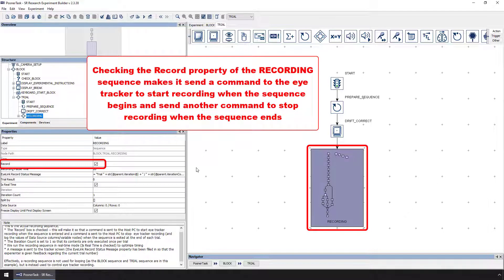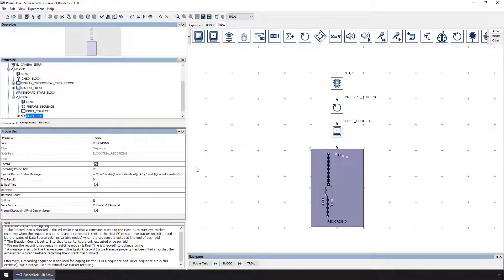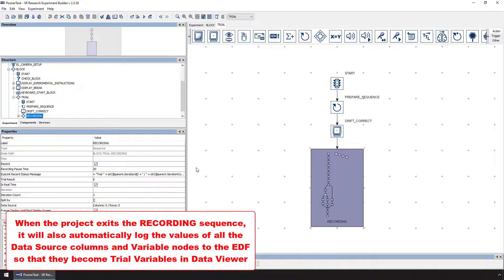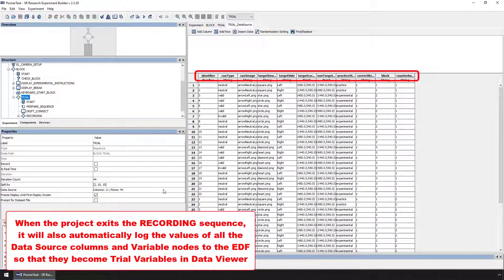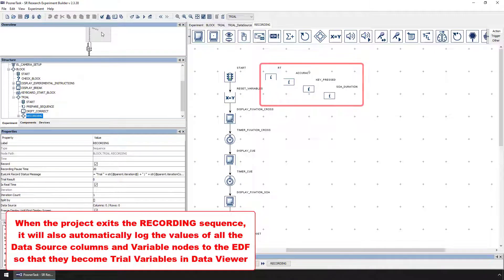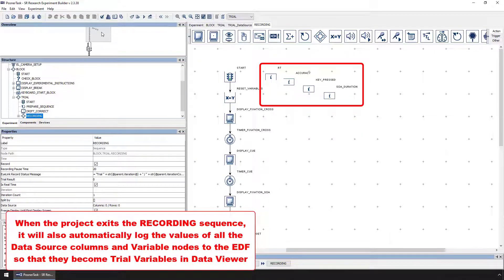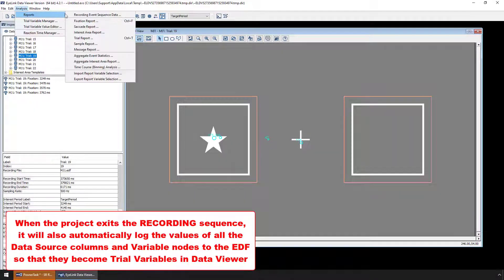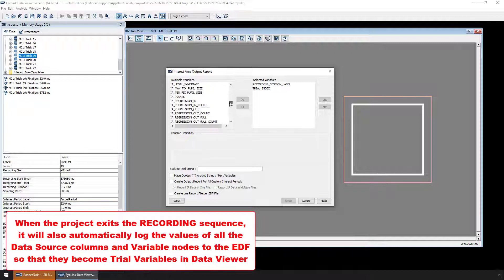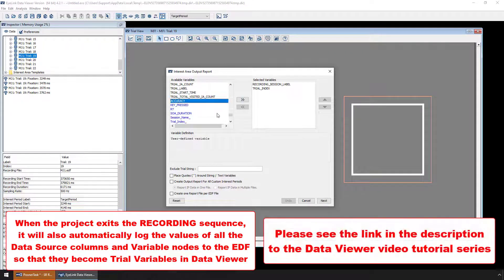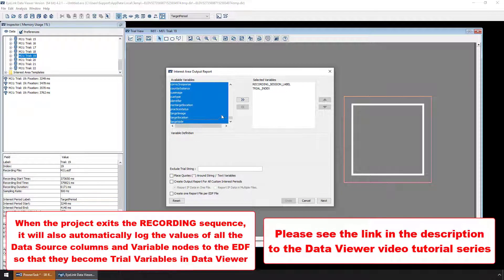Additionally, when the experiment exits the recording sequence, it will also send a set of special messages behind the scenes to log the values of any data source columns and variable nodes in the project. This will allow those variables to be accessible in Data Viewer, including in any of the output reports that can be created. Please see the video on Data Output Reports in the Data Viewer video tutorial series for more information on this.